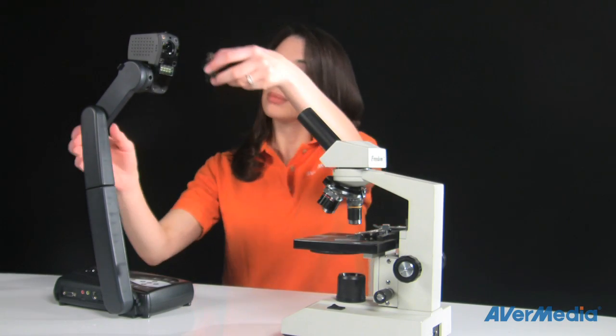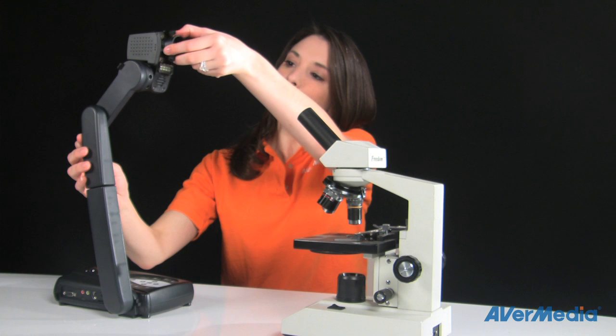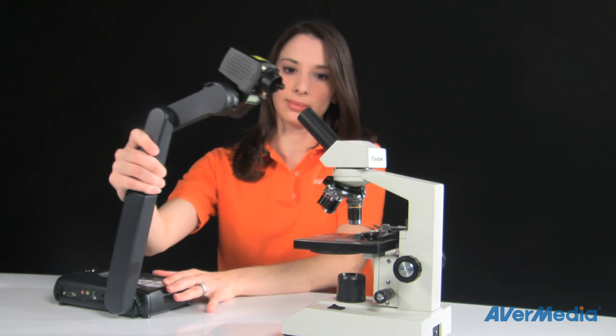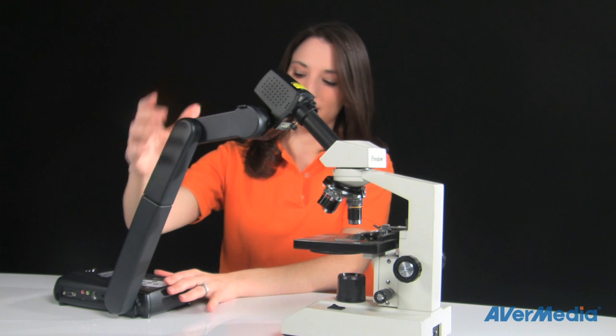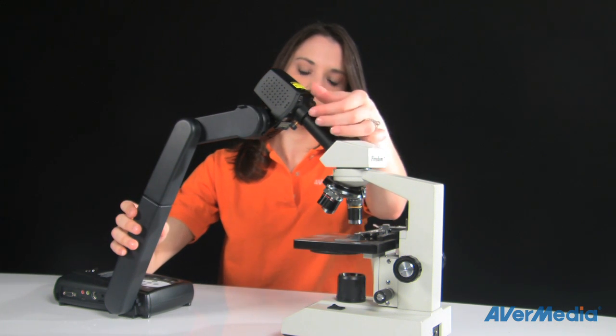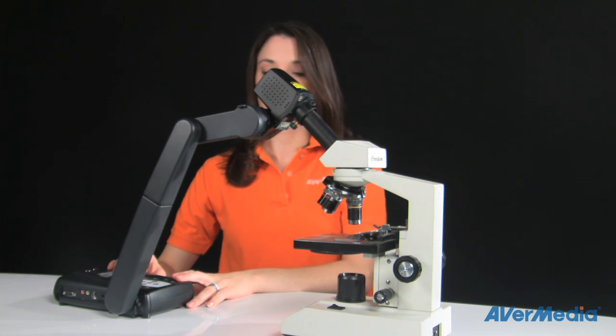First, take the appropriate sized microscope adapter and then snap the unit to the bottom of the camera head. Be sure your microscope is powered on and focused. Then connect the eyepiece to the coupling on the adapter and tighten the screws on the side to secure it into place.